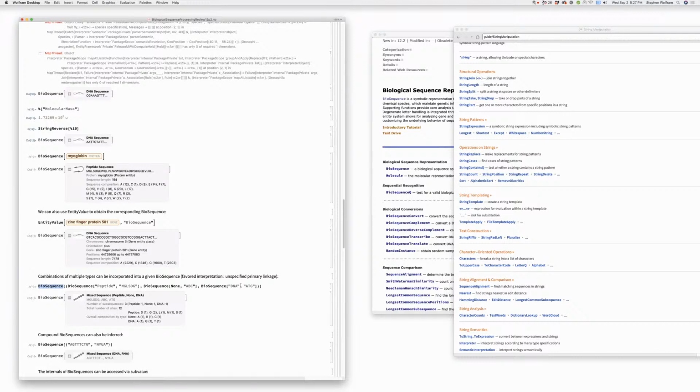Go ahead. Maybe let's take its simplest example. We want definitely to represent a double-stranded DNA. So yes, we need at least 2 strands of DNA that we put in one biosequence and then add hydrogen bonds. Yes, but look, in this case, you've got end-to-end.